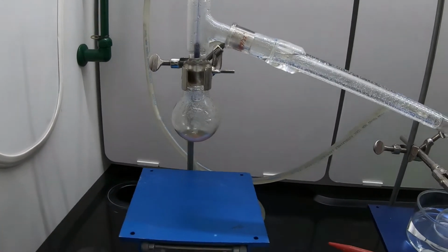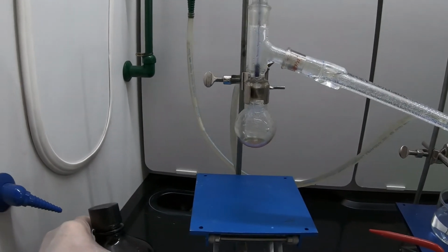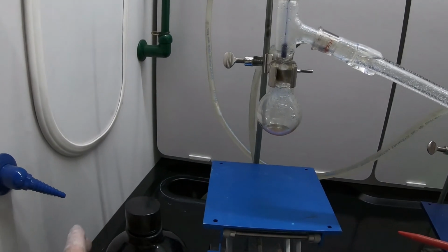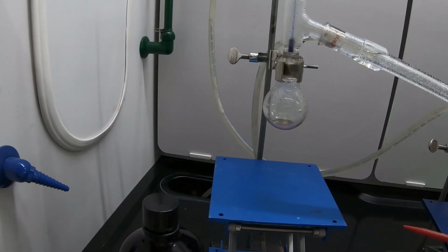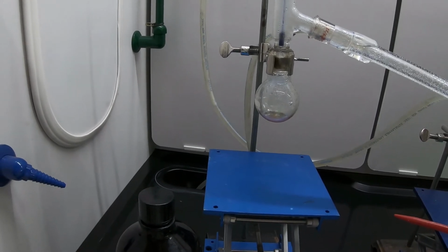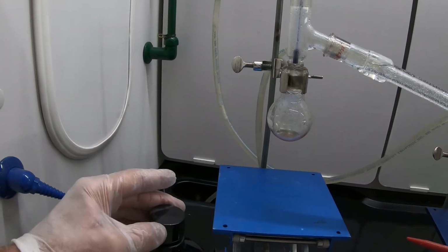And so what I'm going to do is, as I disassemble the glassware, I'm going to rinse it into a container. So I've got organic waste. It's primarily acetone in there now, from other rinses. This would not be washed in the sink. The smell is too strong, and it's water insoluble. These are alkenes, very hydrophobic. Water won't really do much for us. However, using a small amount of acetone, it should get nice and clean.